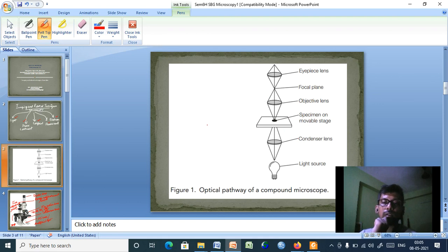So, an image is usually formed in light microscopy by a suitable staining. It increases the quality of the sample. Along with it helps to differentiate various portions or various parts of the particular specimen of interest.